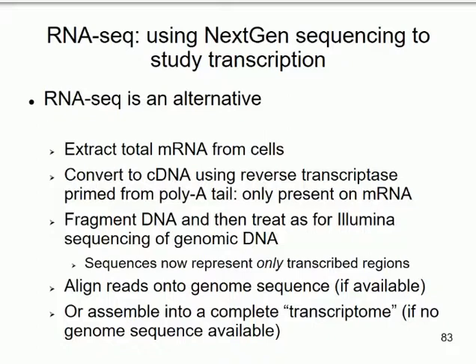Now, if you're lucky, you'll have a complete genome sequence available for the organism. And then the analysis step is, as before, you have to do the same sort of quality control. And then you assemble the reads, you align the reads against your reference genome to see which parts of the genome are being transcribed.